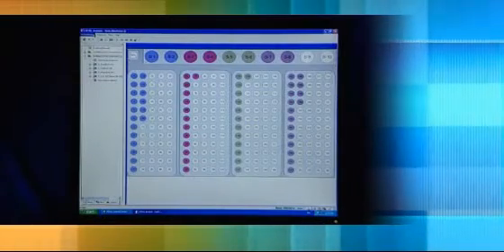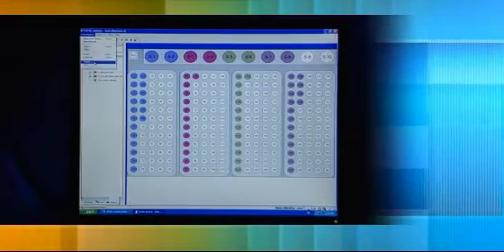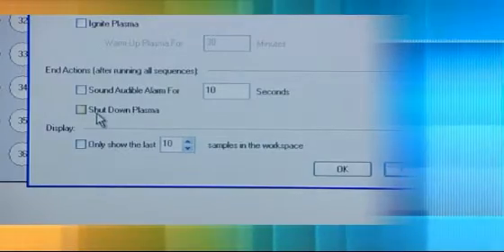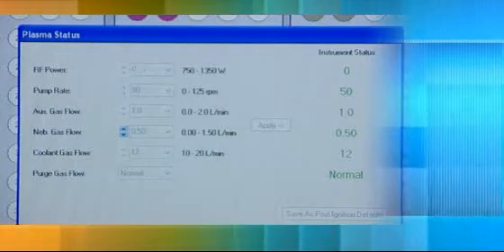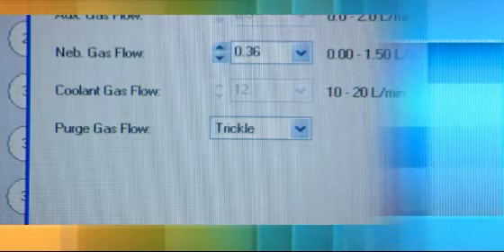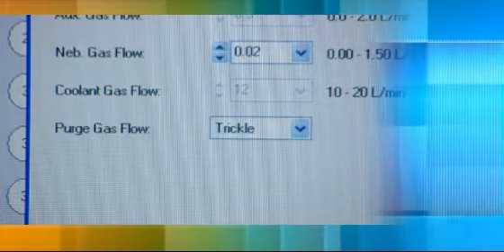Cost saving features come as standard with the ICAP 6000 and ITIVA. For example, the automatic plasma shutdown on completion of an analysis initiates nudge mode to save wear on pump tubing and sets the optics gas purge to a low trickle flow rate to save gas.